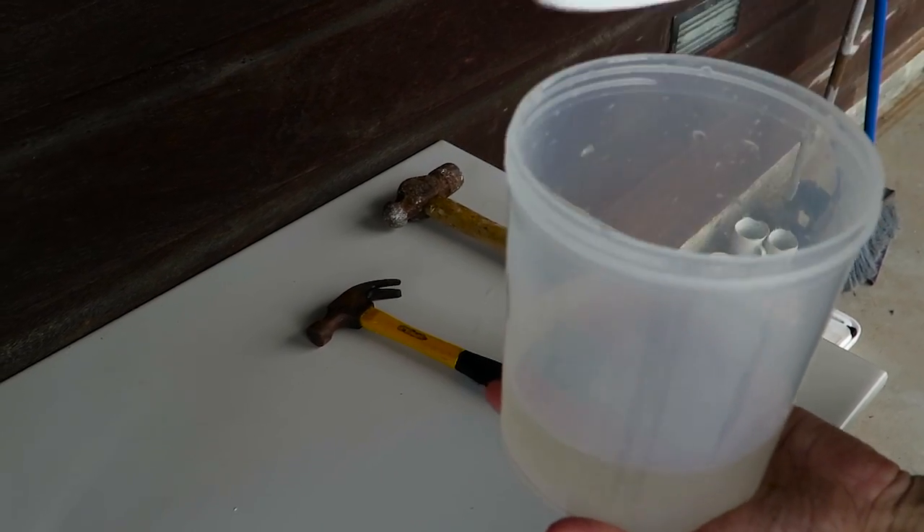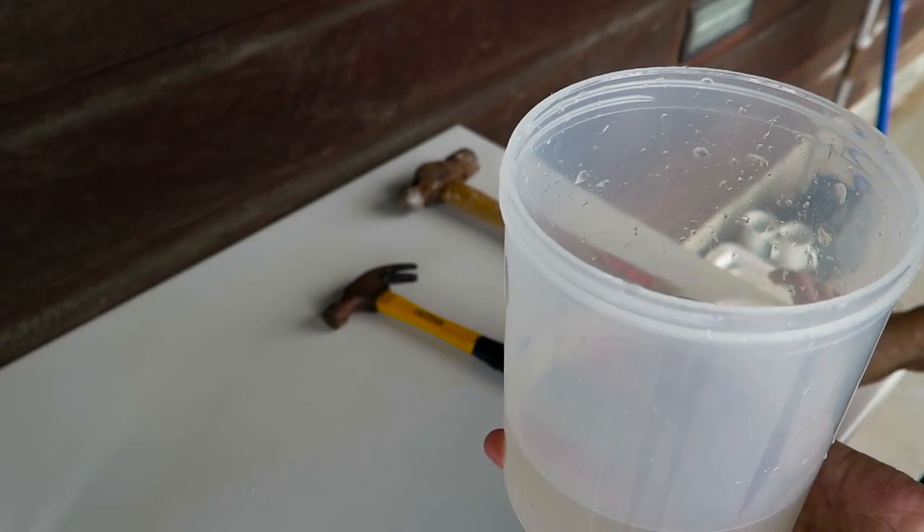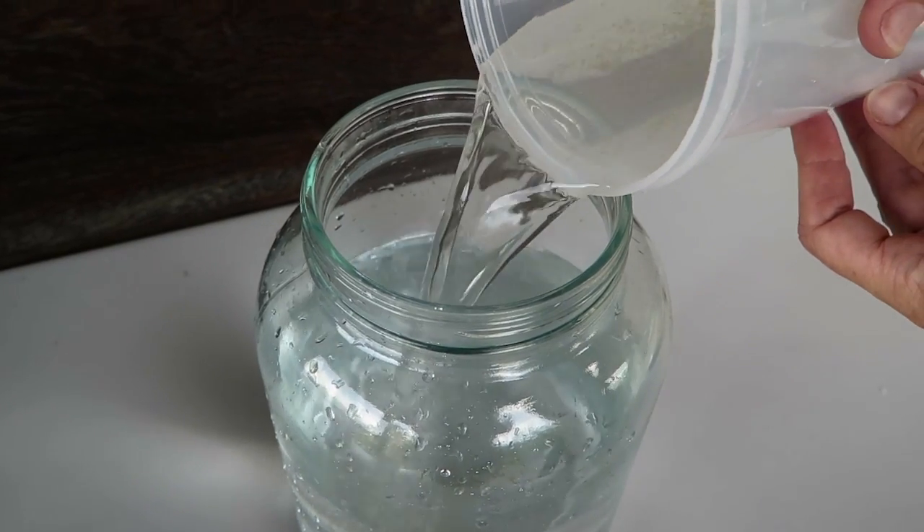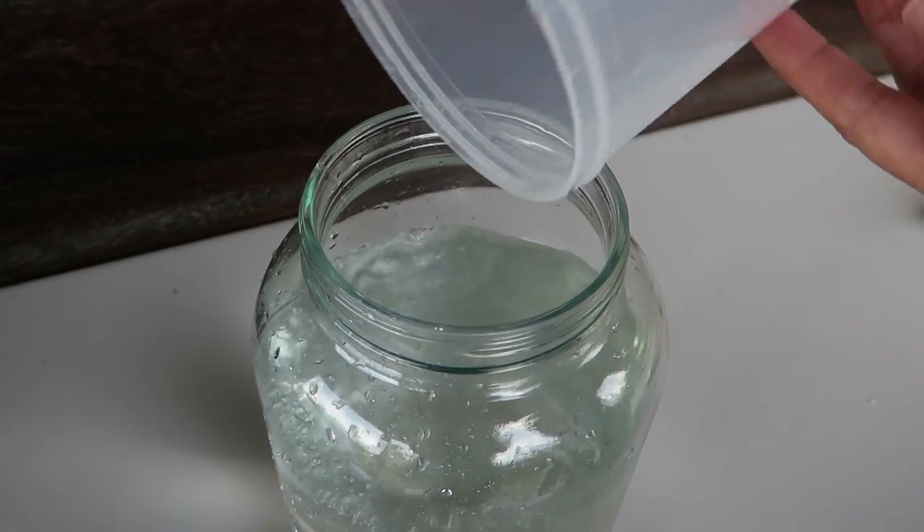You can place the sample in a cooler or a bucket to take it back to the lab. You may want to dilute dense samples, and in general you want to keep the sample cold and sort it within the next few hours so that the animals remain alive.